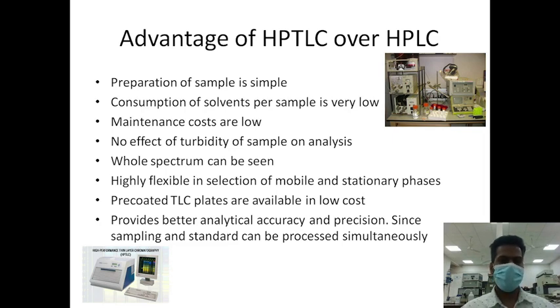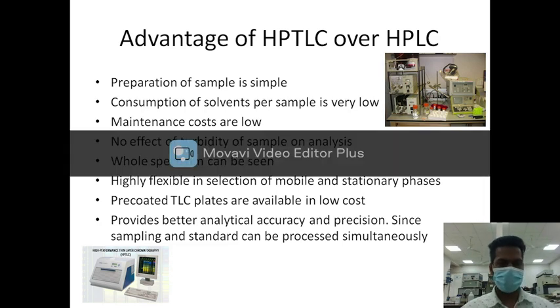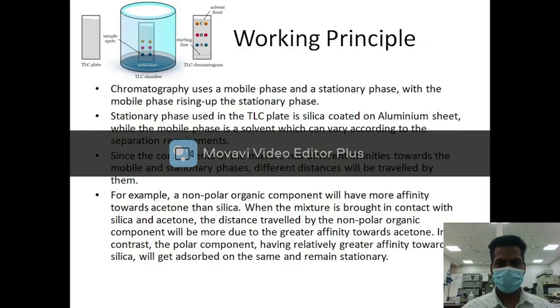In HPTLC the precoated TLC plates are available at low cost, and HPTLC provides better analytical accuracy and precision since sample and standard can be processed simultaneously.